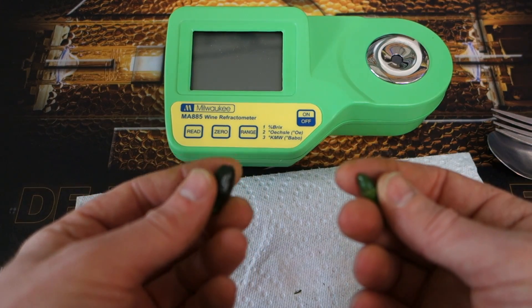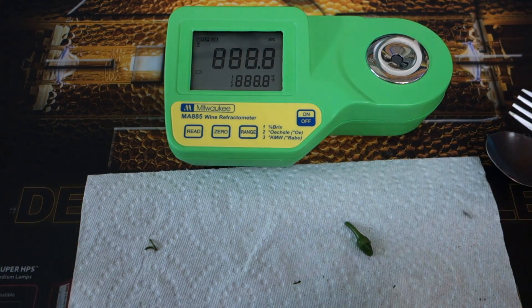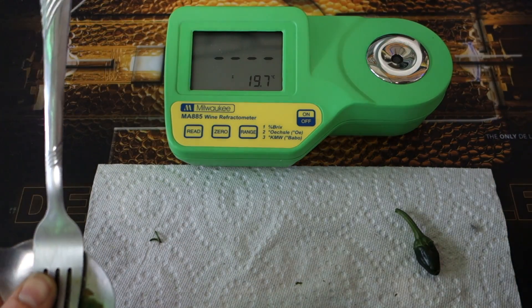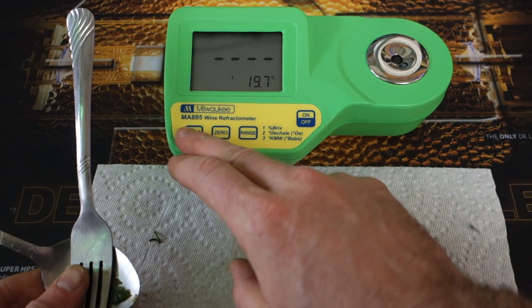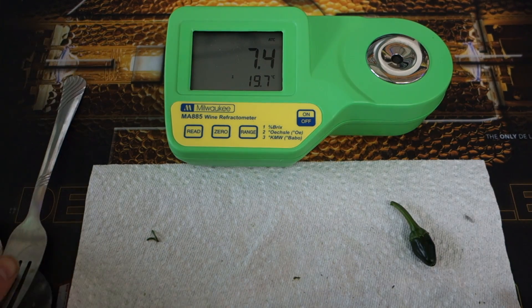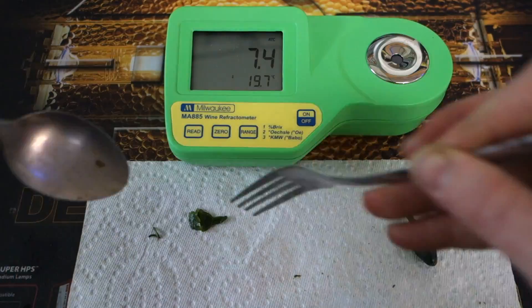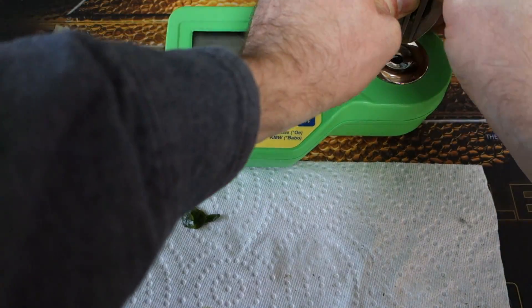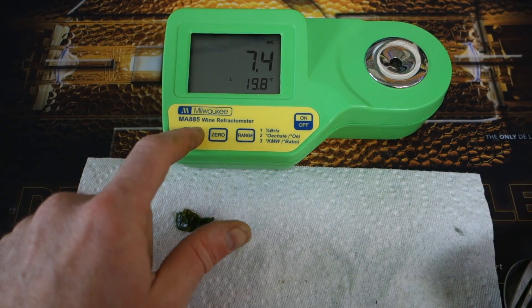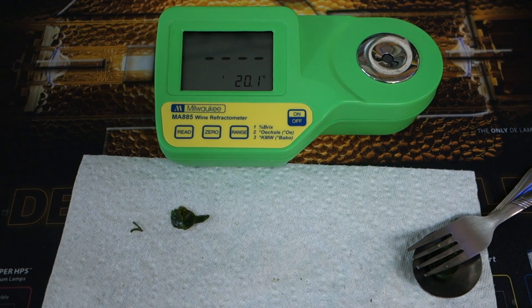I have two pretty young peppers from each plant and I'm going to squeeze a drop out of each to see if the sugar is any different from the leaves to the fruits. So 7.4 on our hydroponic one — it's exactly the same.